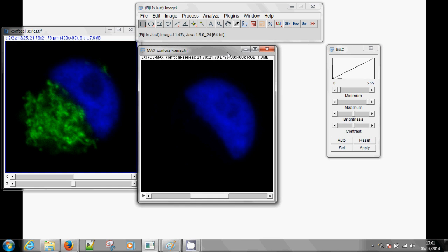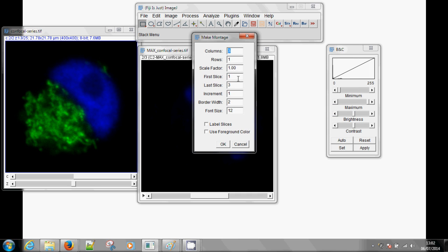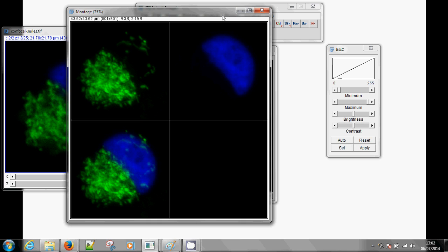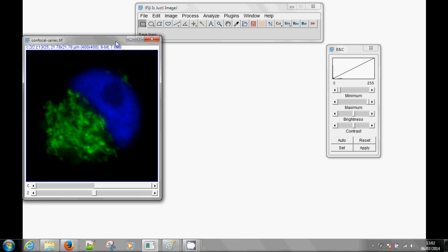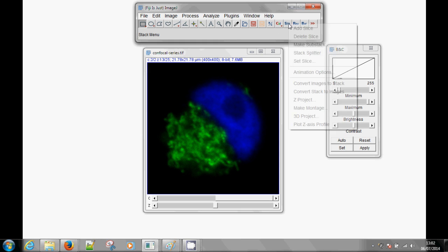So this make montage function, I didn't change anything about it, which means if you want to display it in another pattern, for instance 2 columns and 2 rows, you can, of course. The button is just giving you access to this function differently, in a faster way.